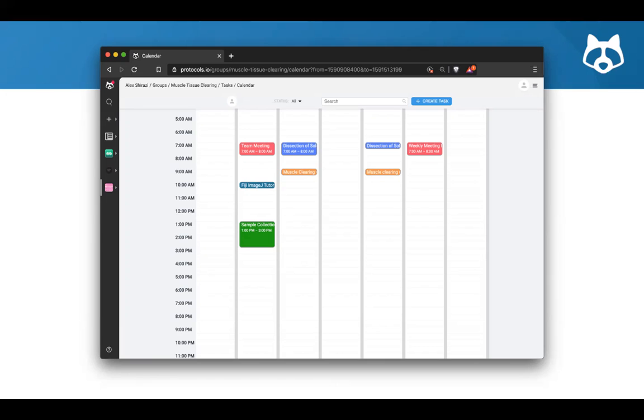Can the same task be assigned to a group of participants and worked on separately? For example, a group has the same protocol, but all work on individual protocols. Different tasks can be assigned the same protocols. It would just be saved as a different run record. So if you do want to run protocols simultaneously with different people, that can be done, and you can have different run records. I don't know if that answers the question.